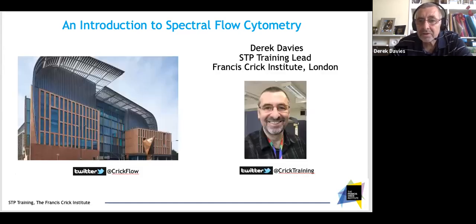So if we move to the next slide. Hi. Right, so today we're carrying on our journey through flow cytometry. Those of you who have been to some of these webinars over the past 3 or 4 months will be aware that we've started with basic flow cytometry, an introduction to fluorescence and fluorochromes. We've looked at panel design, compensation and data analysis. We've looked at some particular applications. But we've also looked at a couple of parallel technologies. So we've seen the rise in recent years of imaging flow cytometry, which we looked at, and mass cytometry. And one of the hotter topics of today is spectral flow cytometry.